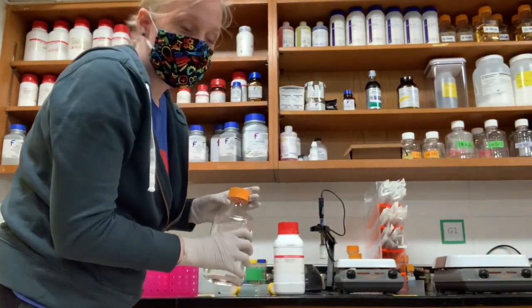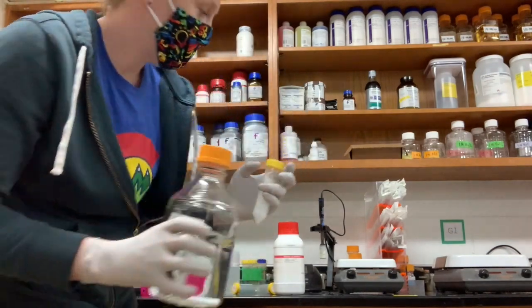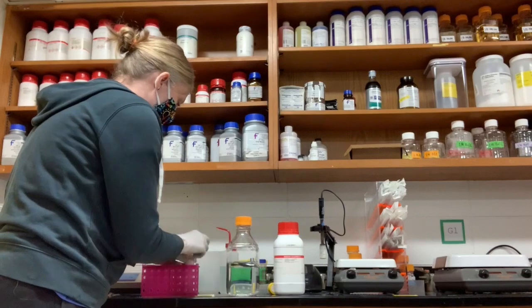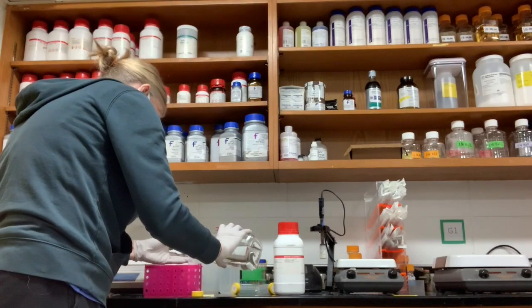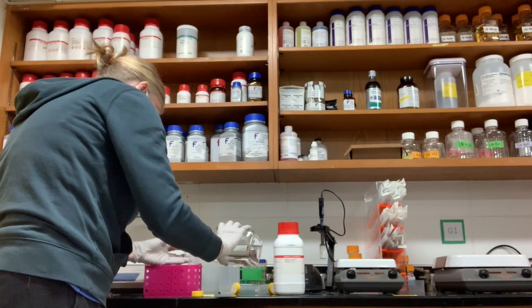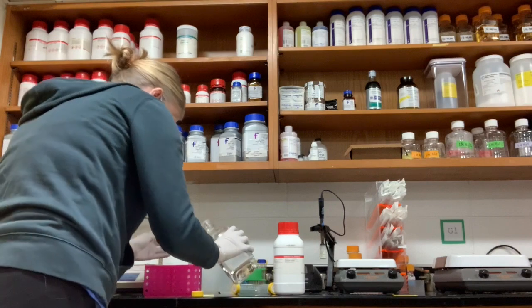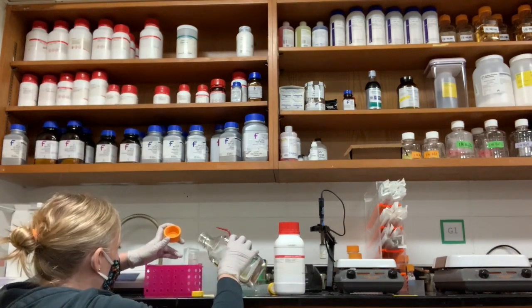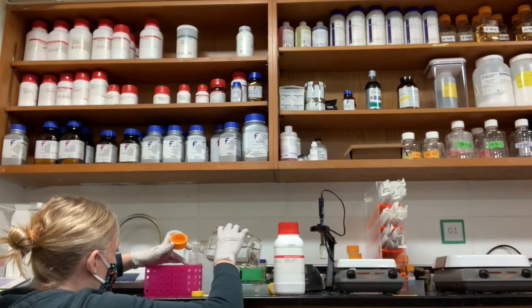All right, this is a very saturated solution, so there's quite a lot of this ammonium acetate in the bottle. I'm going to pour the DEPC or RNase-free water into the tube, and I'm going to get on eye level with it so I can make sure that I add the liquid right up to the 50 ml mark.